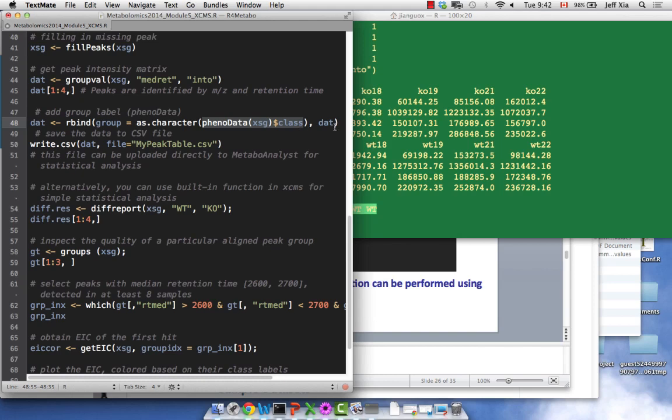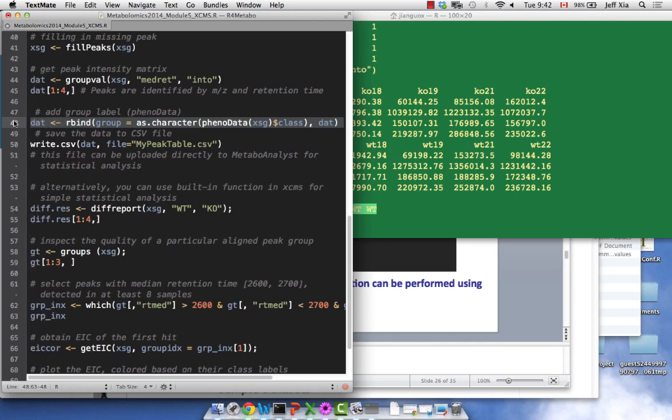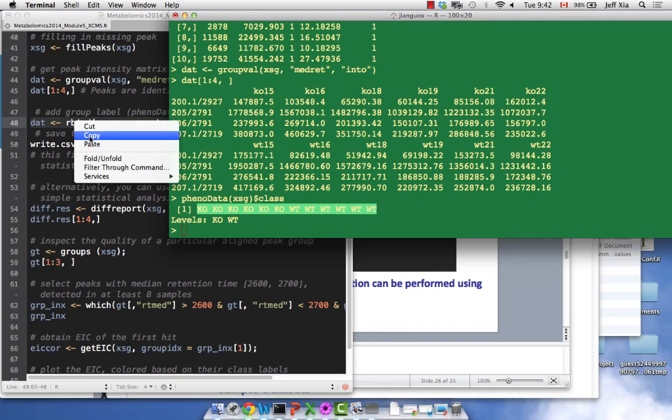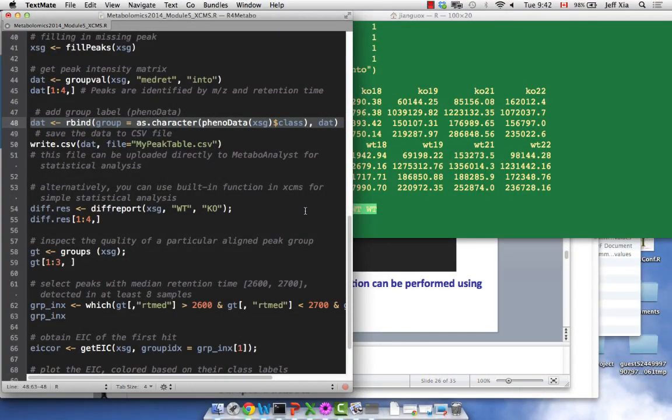Does it mean labels? Yeah, I'm going to talk about that in a moment. Labels means you compare two groups, group one and group two, or control and disease, right? You always say, so far, this is a sample, so which two groups do you want to compare? You need to let the system know, and you will understand it after we issue the command, okay?